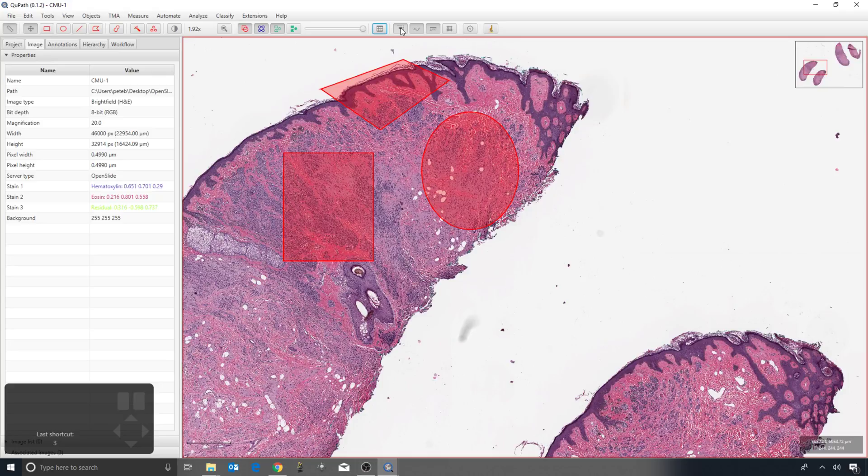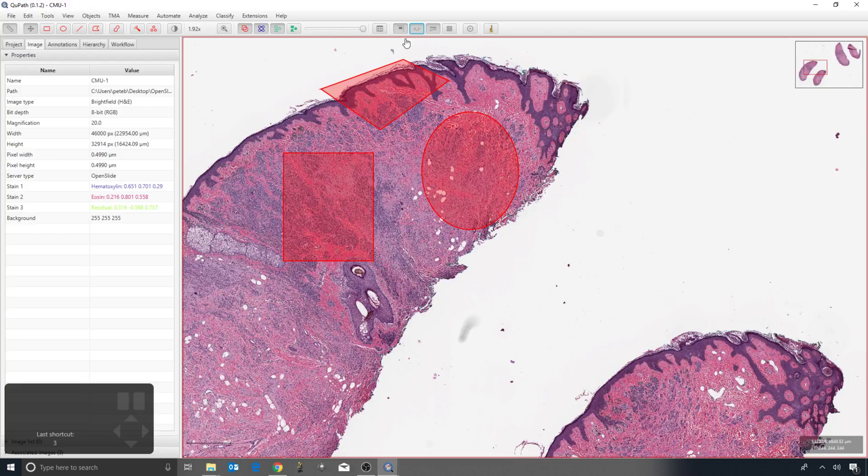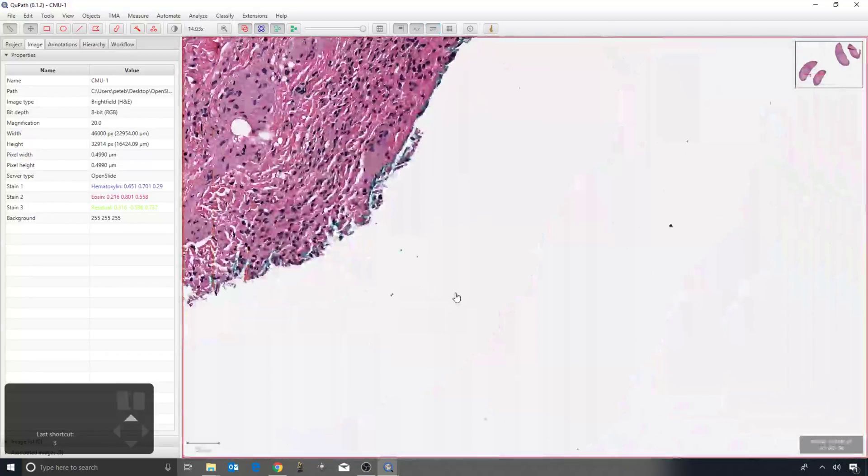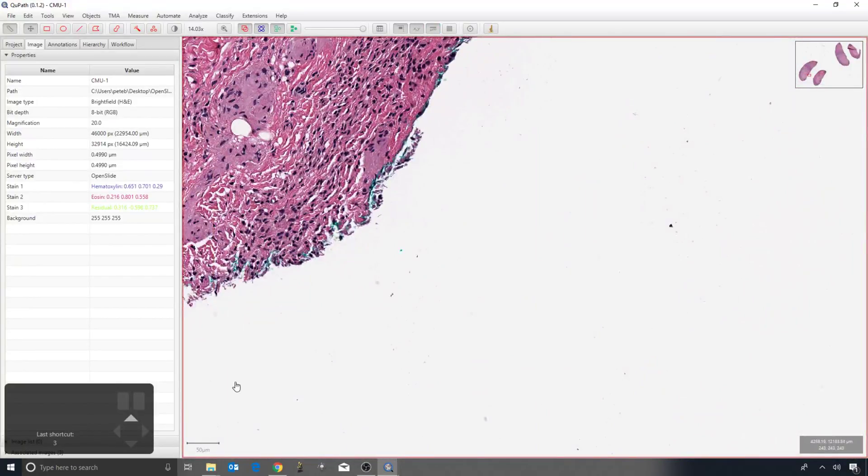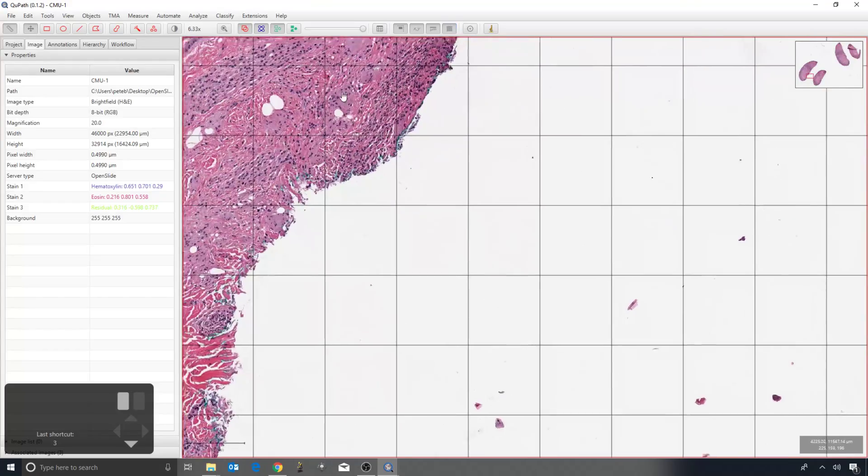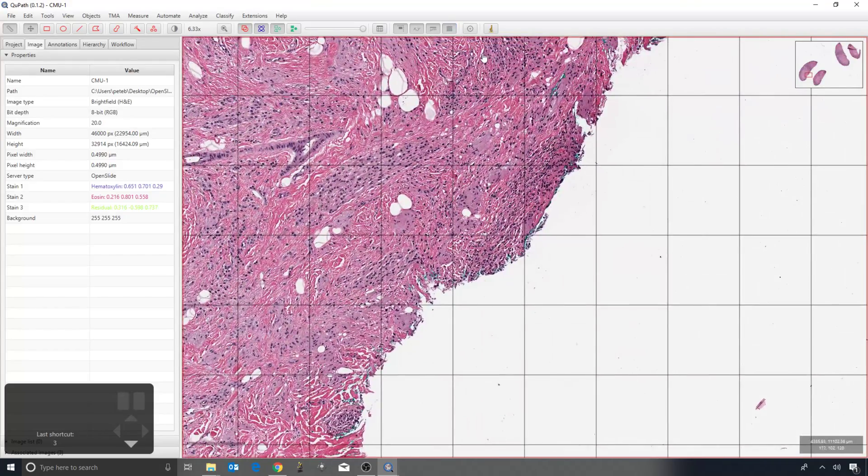And then we can adjust whether or not we have this little preview image in the top right, whether we have the pixel values and cursor location in the bottom right, whether we have the scale bar on a white background on the bottom left. And then the counting grid can be useful, especially if we're using the point tool for manual counting that we've already seen.